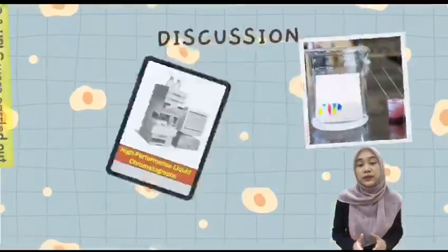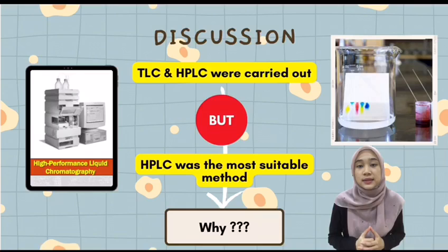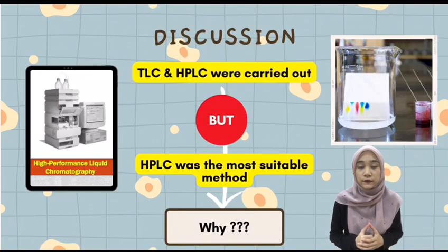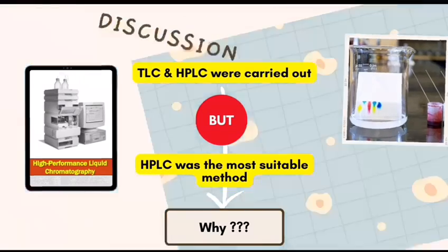In this experiment, thin layer chromatography (TLC) and liquid chromatography analysis (HPLC) were carried out. But since TLC is not precise or accurate for determination, HPLC was selected as the most suitable method.